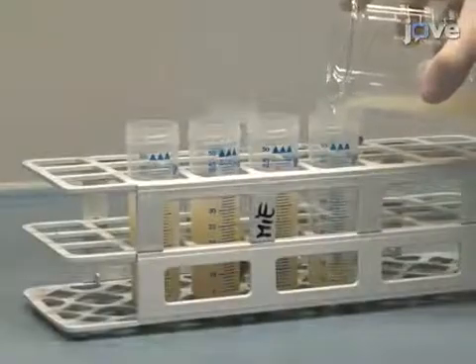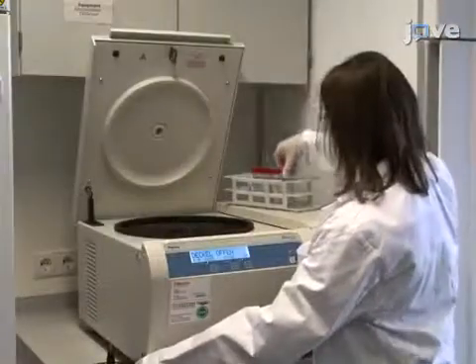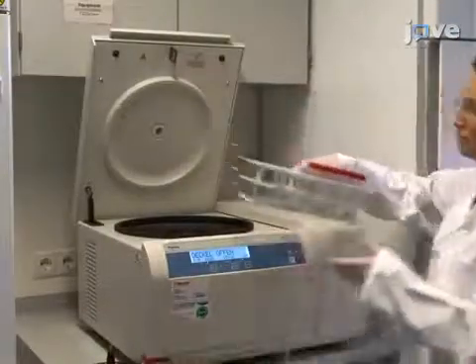Mix and pour into new centrifuge tubes. Centrifuge the mixture at 1030 times G for 15 minutes at room temperature. Discard the supernatant.